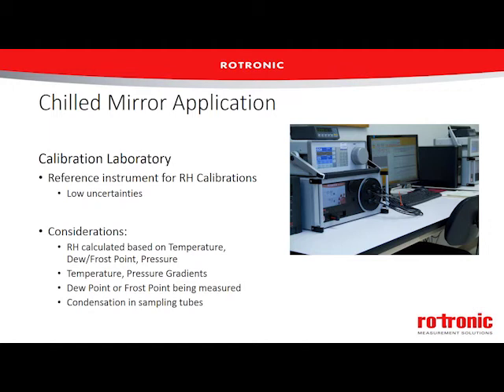We do need to watch out for temperature and pressure gradients. With chilled mirrors, we can potentially have issues related to pressure differences in our gas stream causing relative humidity changes. So that's an important thing for us to keep in mind. One of the key things: what is the mirror measuring? Are we measuring dew point or frost point? That has a huge impact on our calculated values.